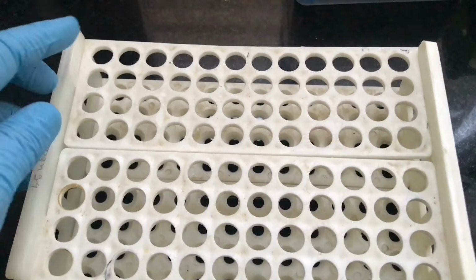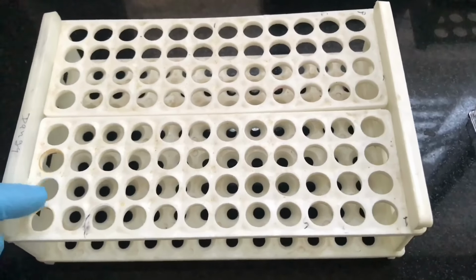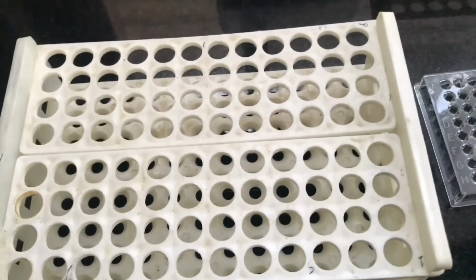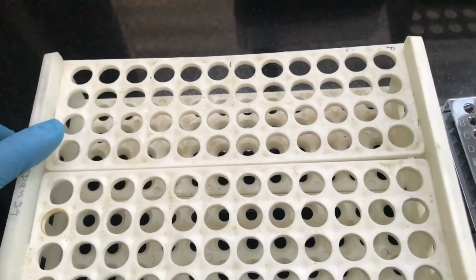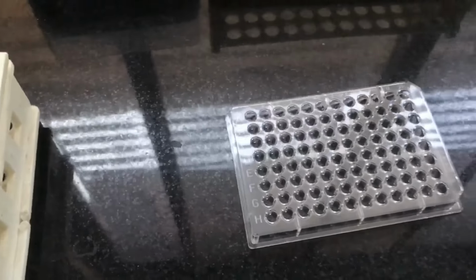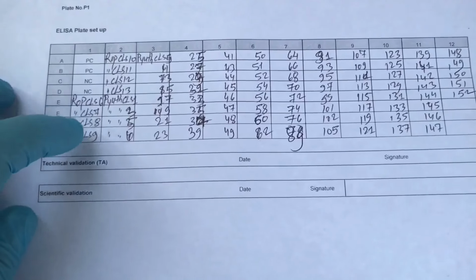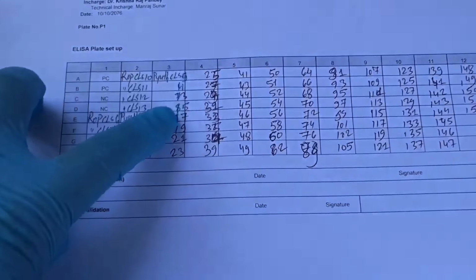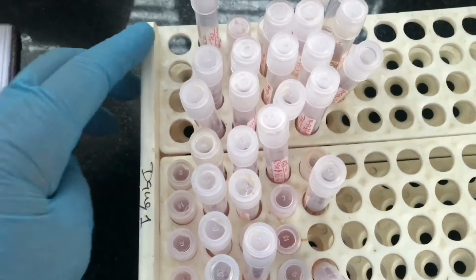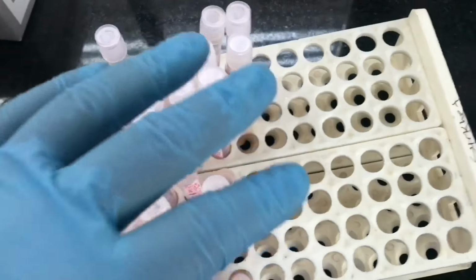And for the simplification of the test, there is a rack where the samples are kept, that is serum for now. The configuration of this rack resembles the 96 well plate, and there is a chart that also resembles the 96 well plate, so the corresponding labeling of the sample is easy. Now we have arranged the serum sample in the rack. The first 4 compartments of the sample rack are empty, as they are for the positive control and negative control.